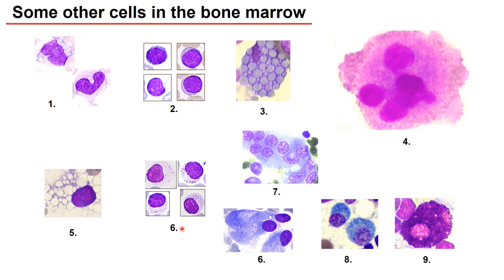Number six: we do have elongated cells where at one edge we do have the very dense nucleus — these are the osteoblasts. In the multinucleated cells, these are the osteoclasts.